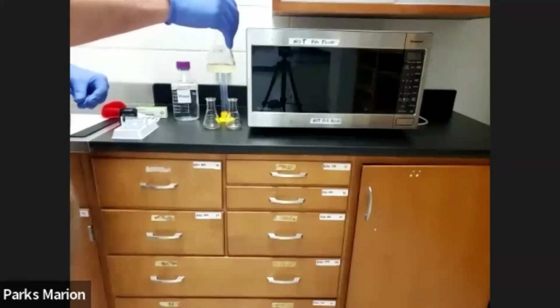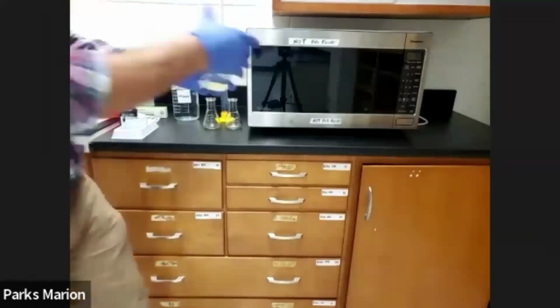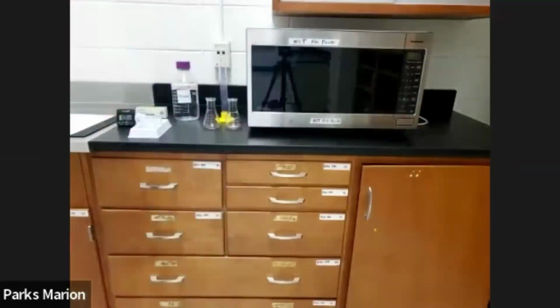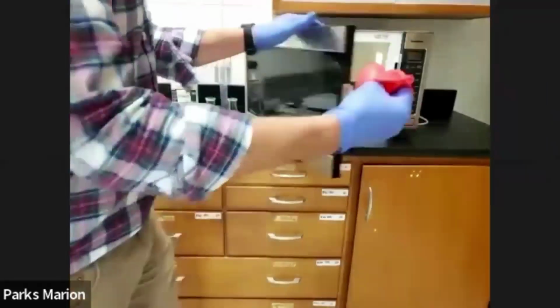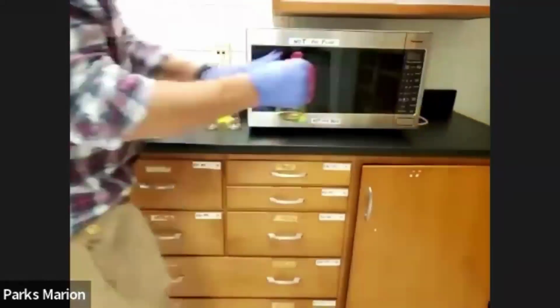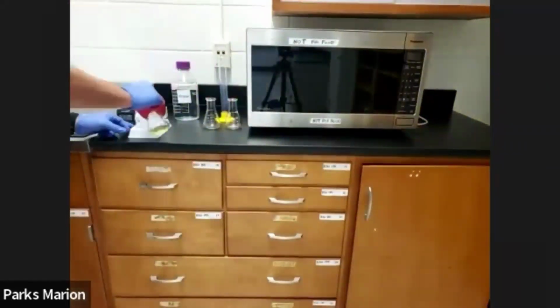Now I'm going to need to heat it for 1 minute in the microwave. Now we're going to remove that from the microwave very carefully using some hot hands, and immediately pour the gel into our casting tray.